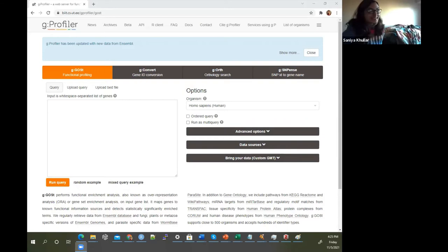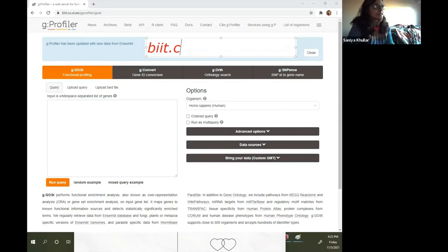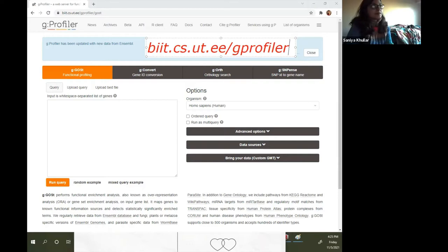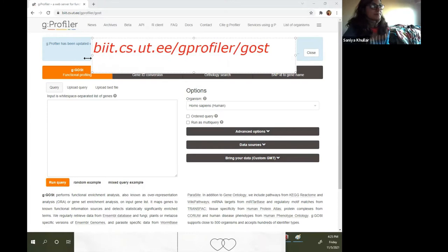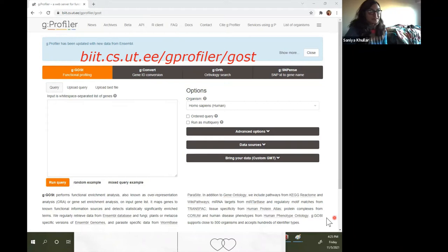This is the site — G profiler. Let me write the link for you. It is biit.cs.ut.ee/gprofiler/gost. I also have the link in the bio. That's the link and this is G profiler, and whatever it can do.